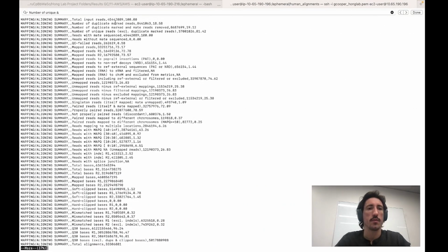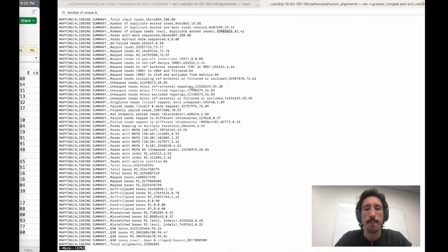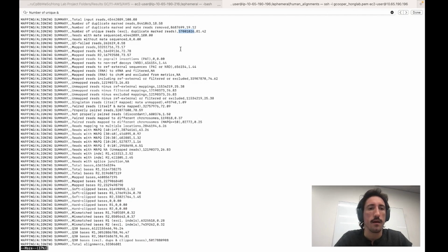So what we'll do is we'll come back here, and I copied over the total reads just to have as a background metric and report to the lab on how the study went. The other thing you'll need is the number of unique reads. And that one I just copied right over here. And then here's the number of mapped reads. And this is the tricky calculation you're going to need to do.